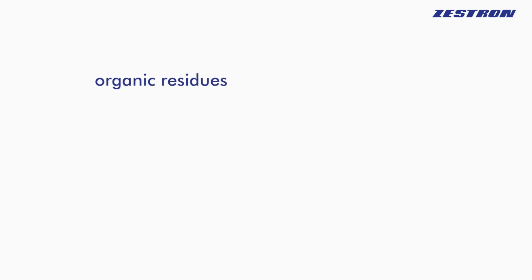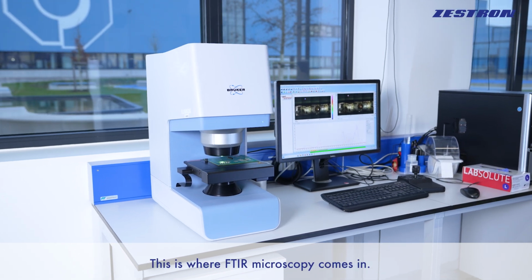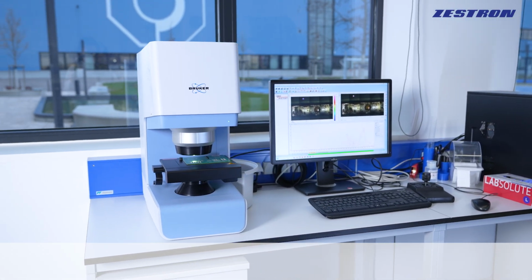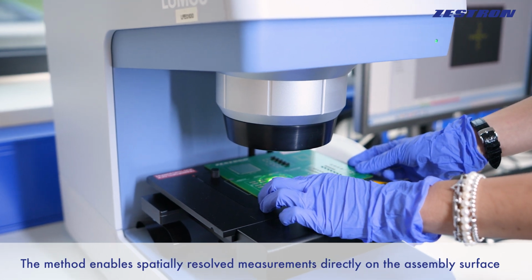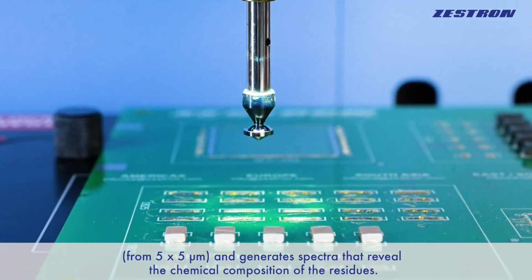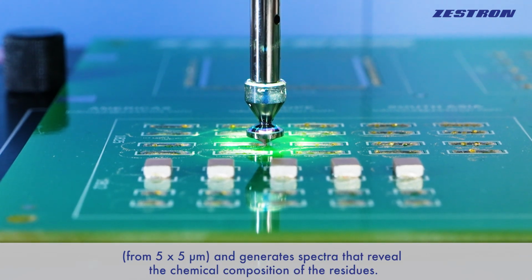In many cases, these are organic residues such as flux, films, oils, or fibers, whose exact composition can only be determined using suitable methods. This is where FTIR microscopy comes in. The method enables spatially resolved measurements directly on the assembly surface from 5 by 5 micrometers and generates spectra that reveal the chemical composition of the residues.